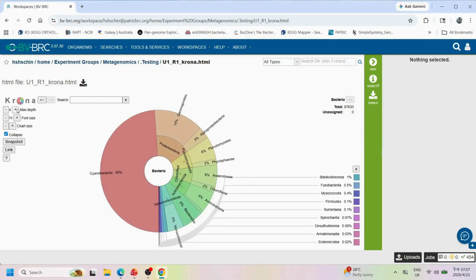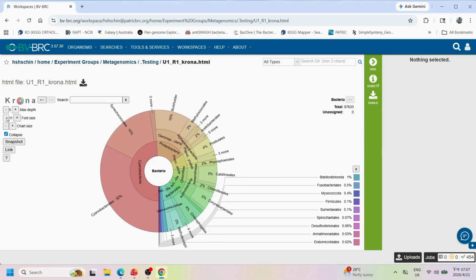For a more comprehensive metagenomic analysis, you can also use pipelines such as DADA2, which provide higher resolution processing of sequencing data.